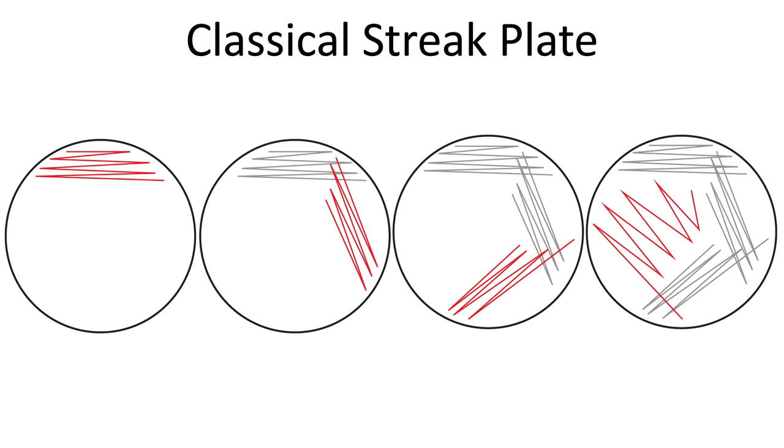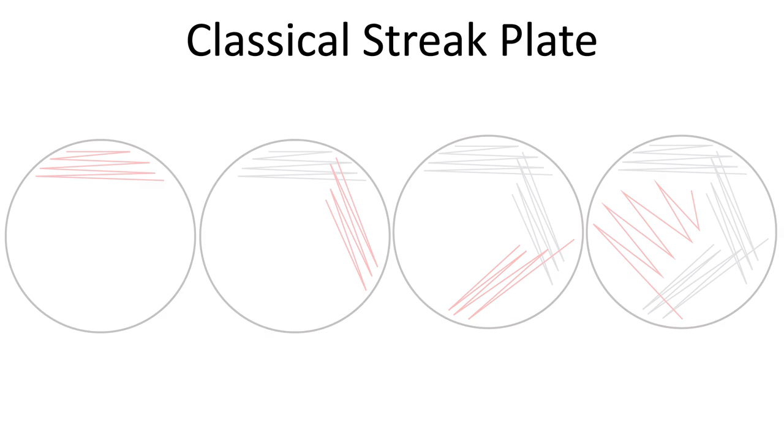So in my opinion this kind of streak plate gives the best results but it can be kind of hard to do. So there's a simpler way that doesn't work quite as well but for most cases is probably good enough. What you do is you take your sample of yeast and you just make three streaks one after the another you don't have the zigzag across one side of the plate.